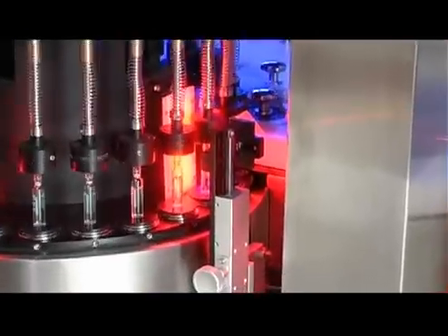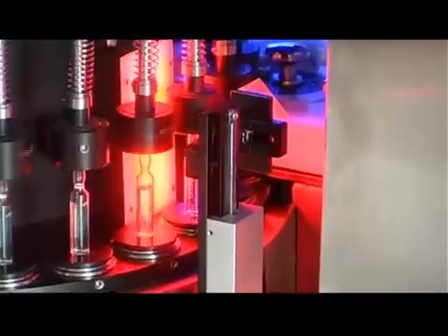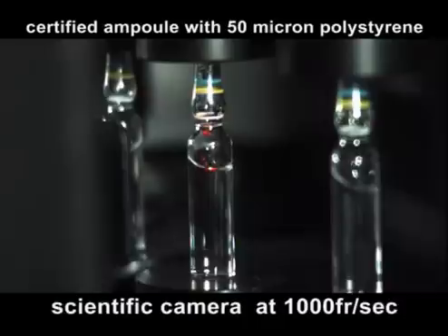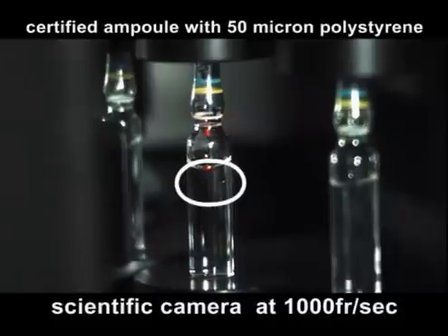Video camera TV3 verifies the particles and filling level and uses a real light which, with appropriate polarization, detects non-reflecting particles. In this way, video camera TV3 inspects both correct filling levels and checks for the presence of foreign bodies which are not very luminous.